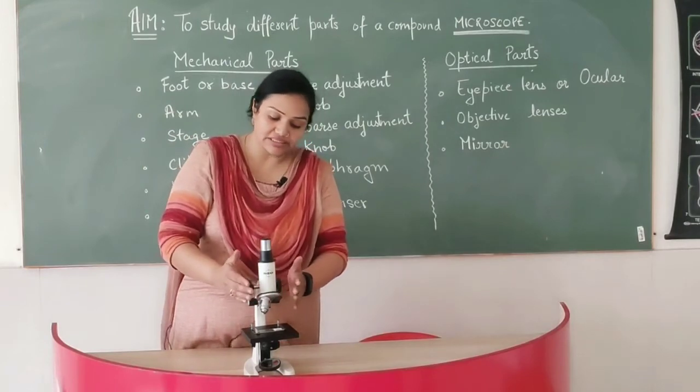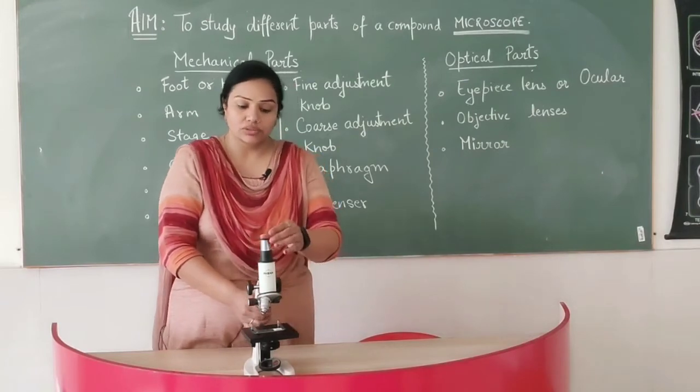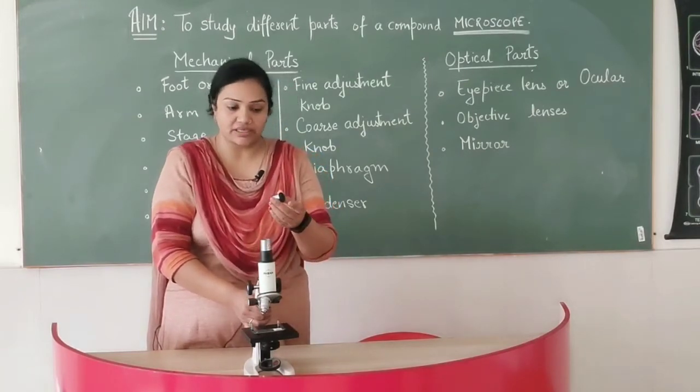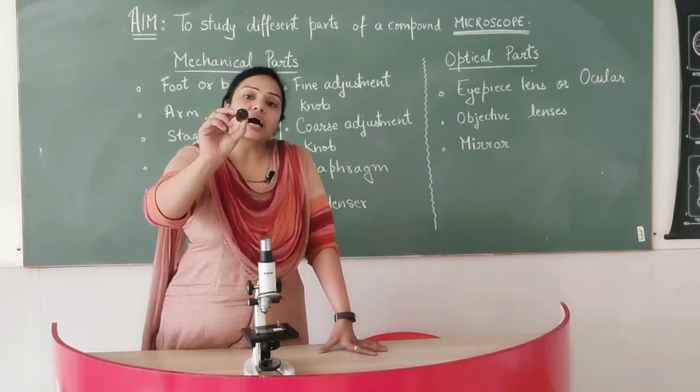So these were all the mechanical parts of the microscope. Now coming to the optical parts of the microscope. See the first part. This is called eye piece.